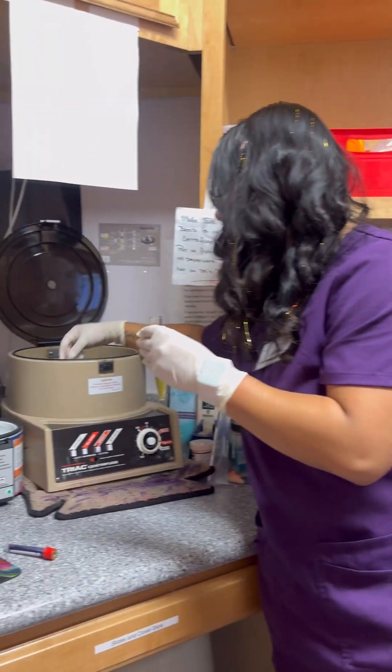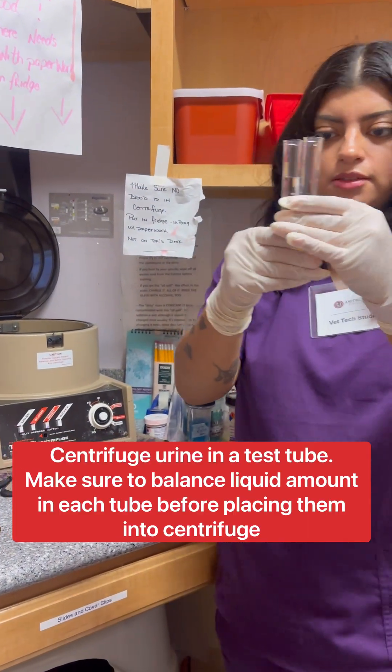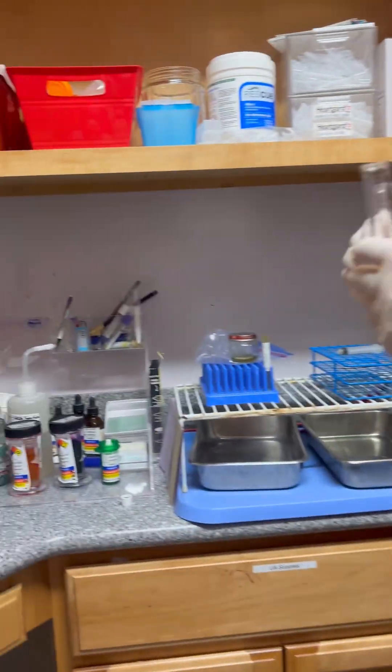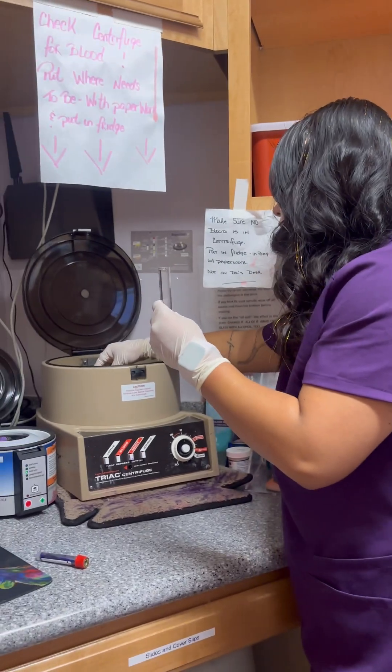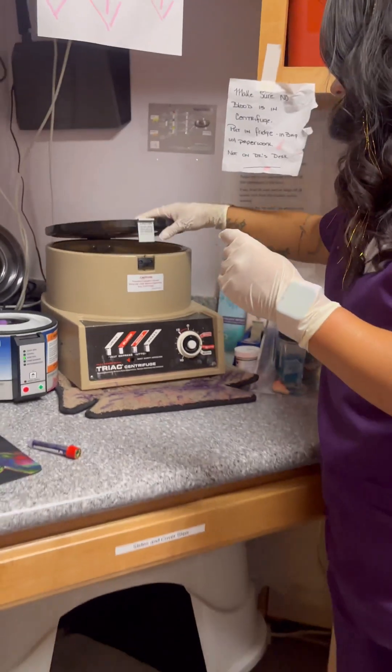This is the centrifuge that I'm going to be using. With this, I'm going to measure it out so that it's balanced. I'm going to put one on that side and one on the other side of the centrifuge to balance it out. Close the door.